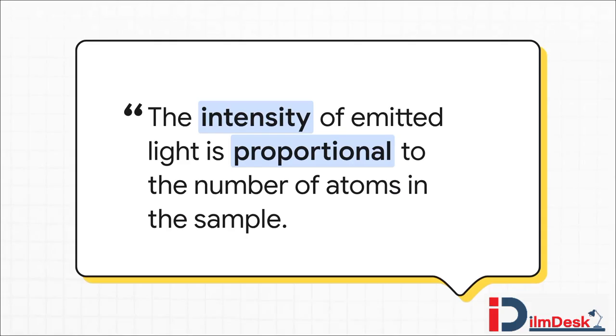And this is where the technique becomes so unbelievably powerful, especially for emission spectroscopy. See, it's not just about identifying the element, it's also about counting it. The whole thing is based on a simple principle. The brighter the light an element gives off, the more of that element is actually in the sample. This lets you do incredibly precise quantitative analysis.